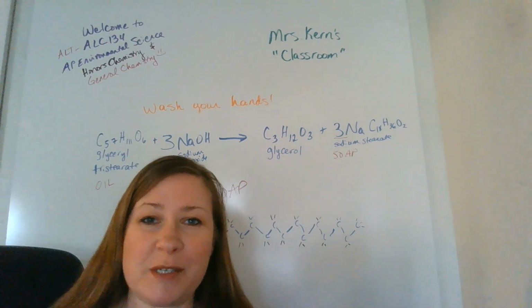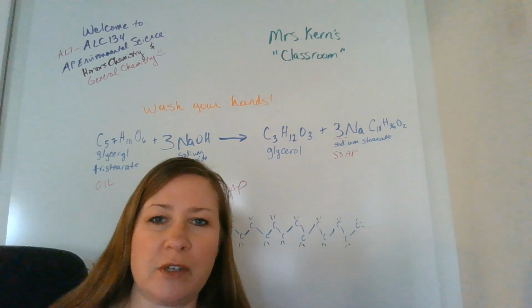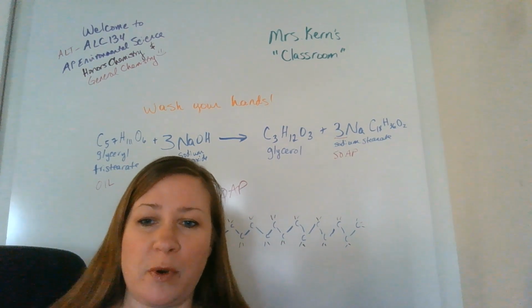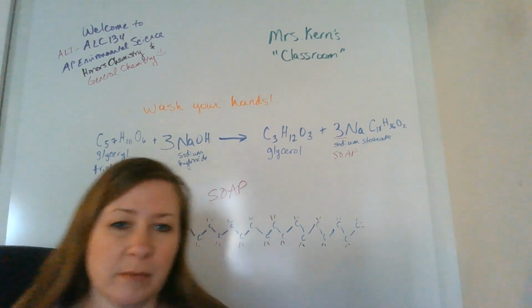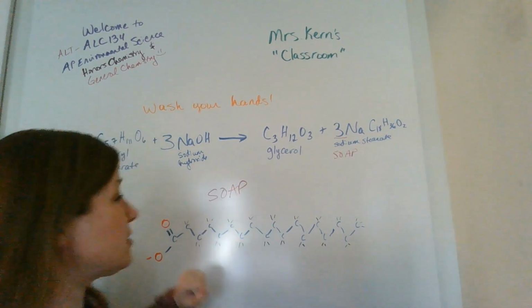Okay, good morning. This is Mrs. Kern, and I'm going to show you today how to make soap. But first, we're going to do a little discussion of the chemistry of soap, a little bit of background before we start the lab. So, on the board behind me, I've got the reaction for making soap.